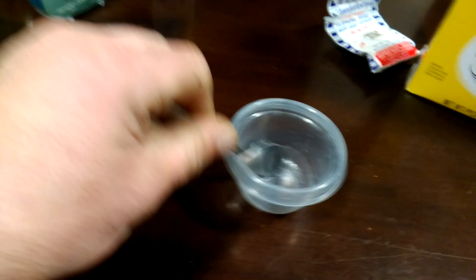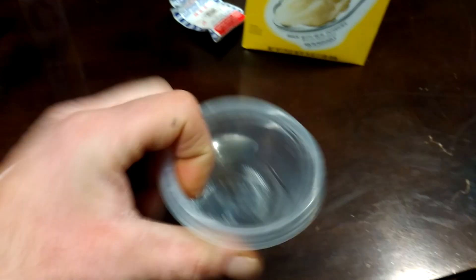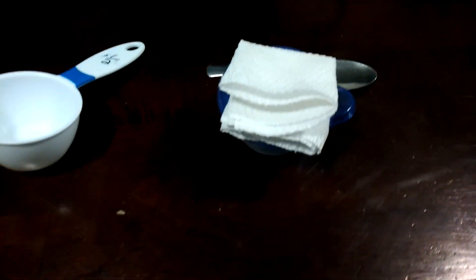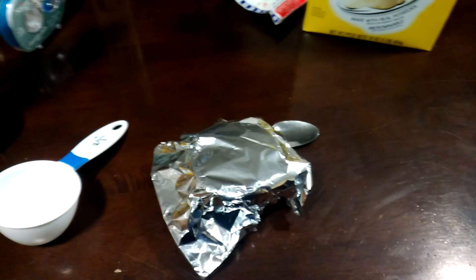Not boiling — stir it around a little bit. Then pour a little bit into these bowls. What you make with what you have will fill eight of these petri dishes. After you get these petri dishes filled up, slap your lid on, put a piece of paper towel over top, fold it up real nice, take some aluminum foil, cover it up, throw it in the pressure cooker and pressure cook away.